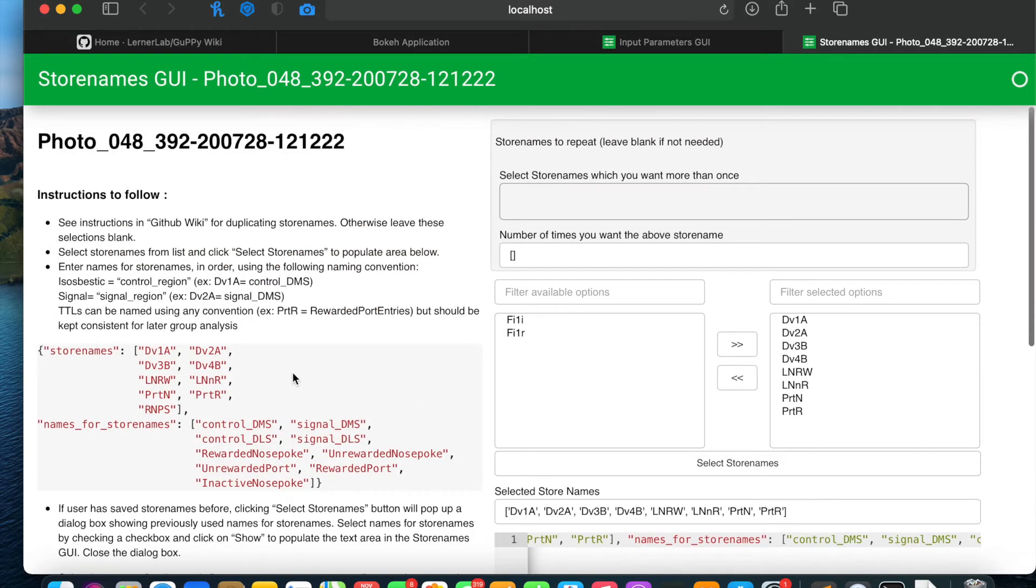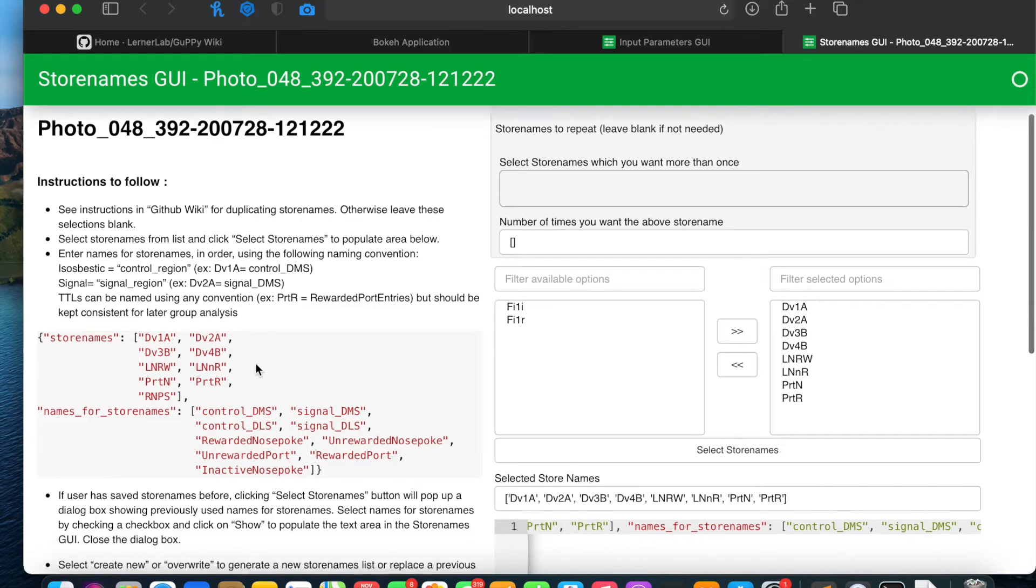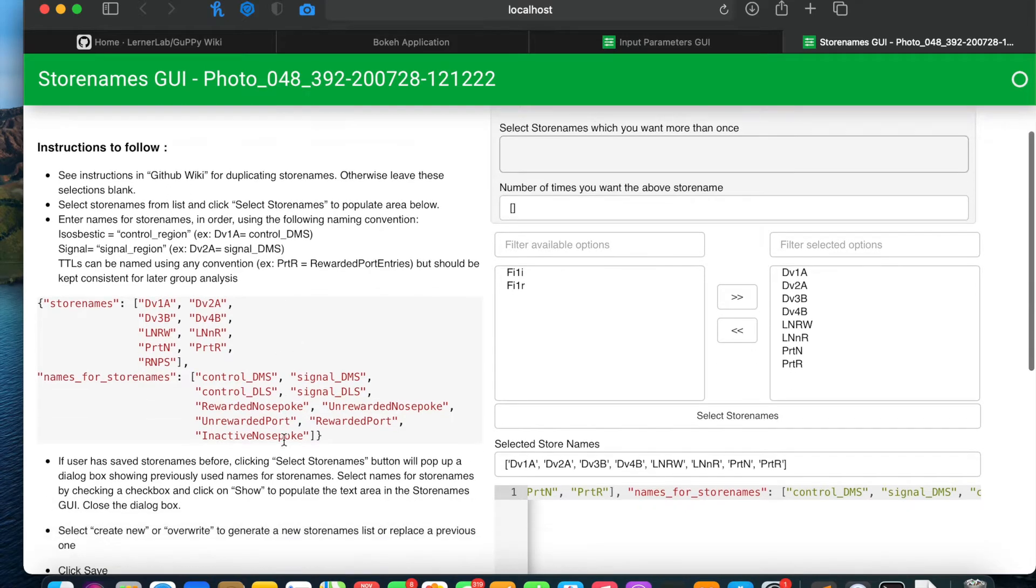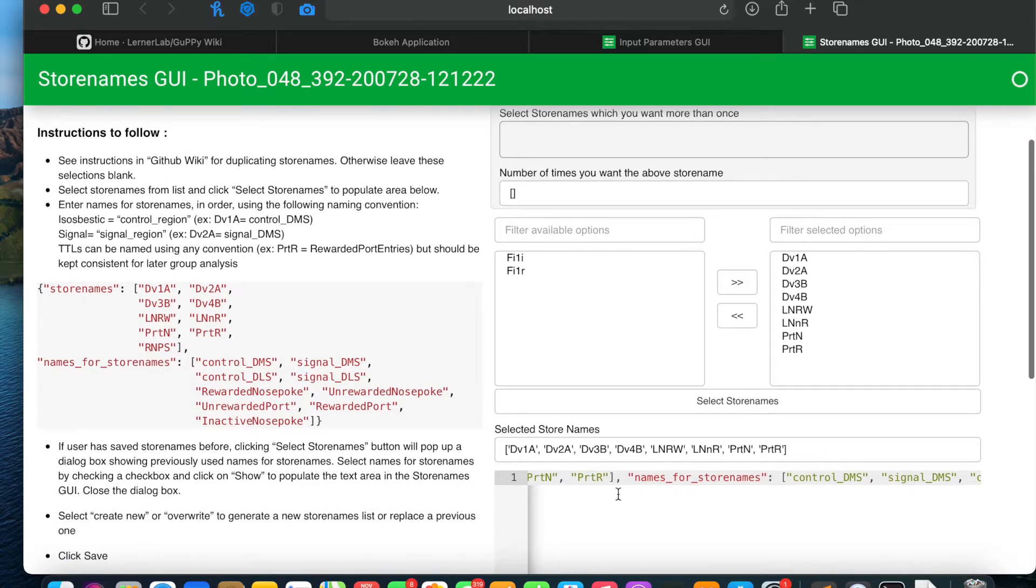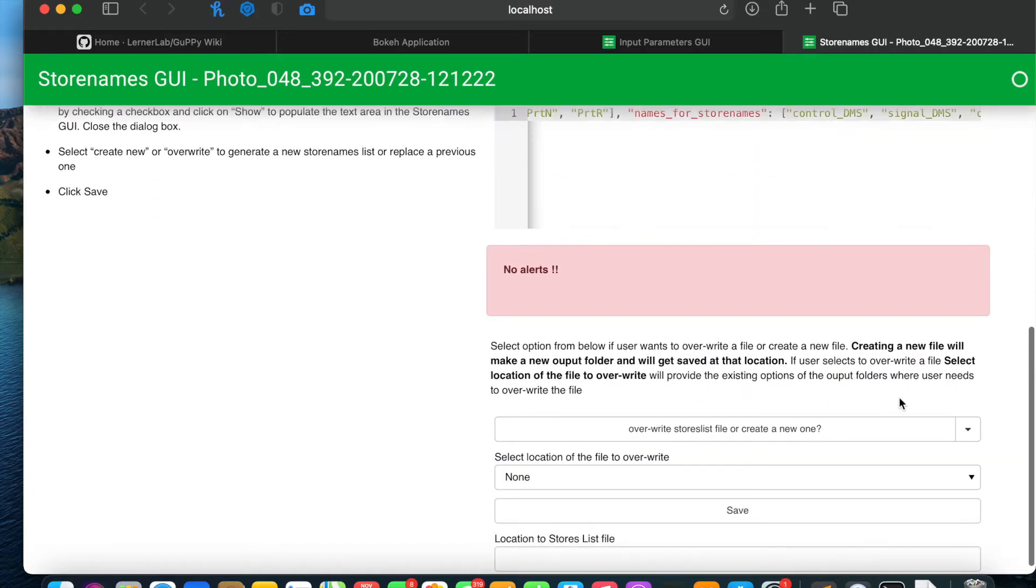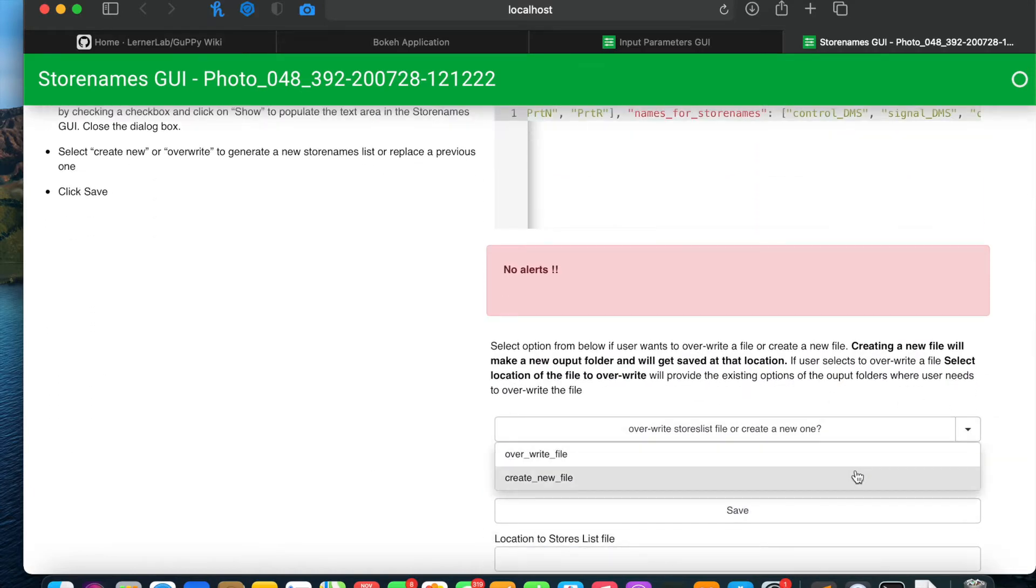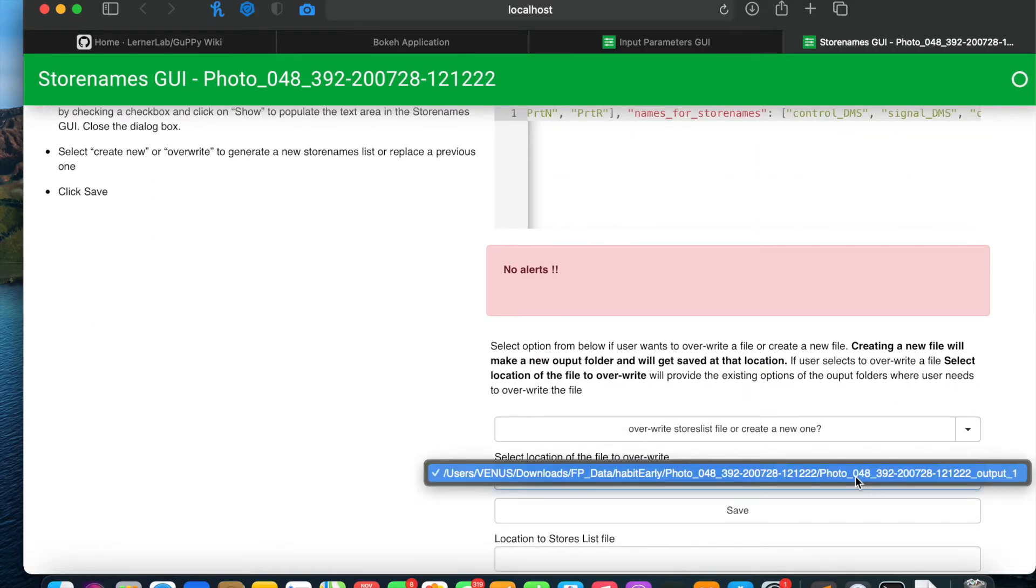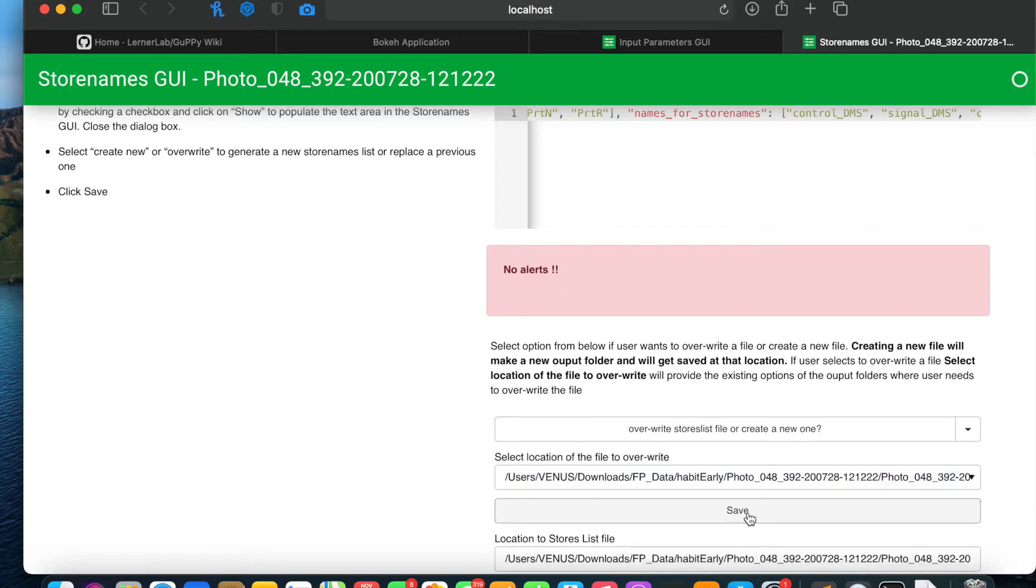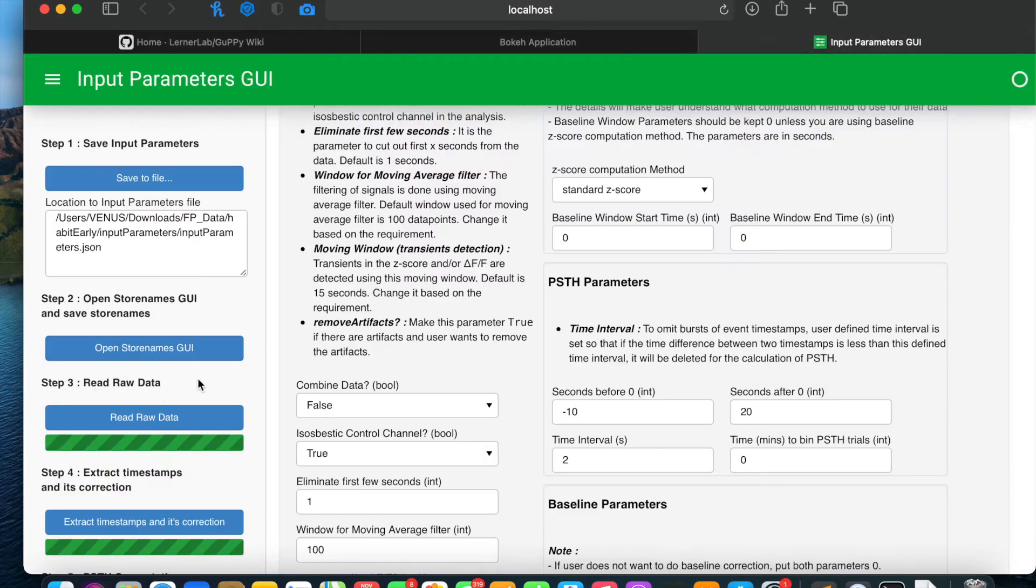Please make sure to follow these instructions for the naming of the store names. I will create a new file. This will show the path where the store name file gets saved. I will save it and then close this window.